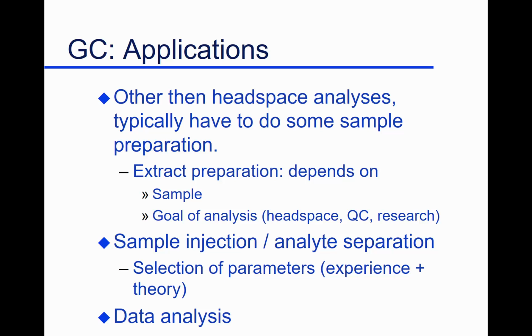But if he had something a little more concentrated, he could simply put a sample in a closed bottle, close the top with a nice septum, and let it sit for 30 minutes. Of course, any volatile compounds will go into the headspace in the bottle. And he can literally just take a syringe, put it through the septum, draw some air, and do his injection, called a headspace sample. So again, it's a fairly simple technique.